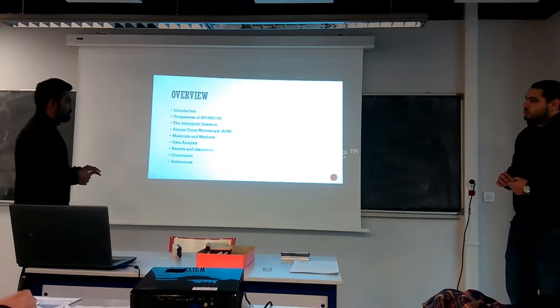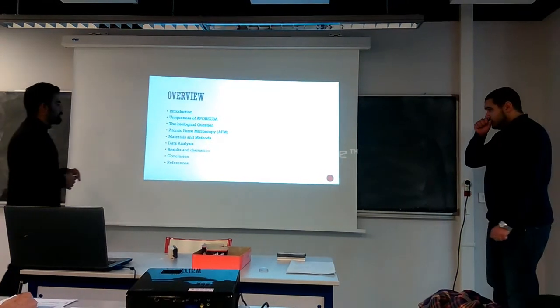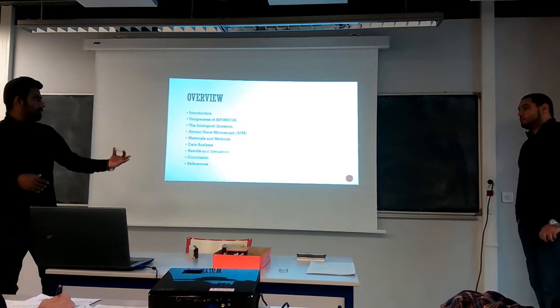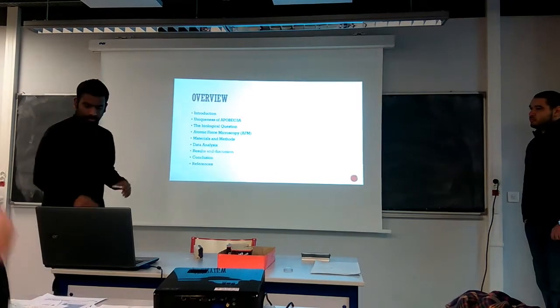And after that, I'm going to briefly explain the concept of atomic force microscopy. Then we move ahead to the materials and methods, to the procedures that they've used in the research paper. And then my colleague Sofian will take over and talk to you about the data analysis, the results, the discussions, and his conclusion.